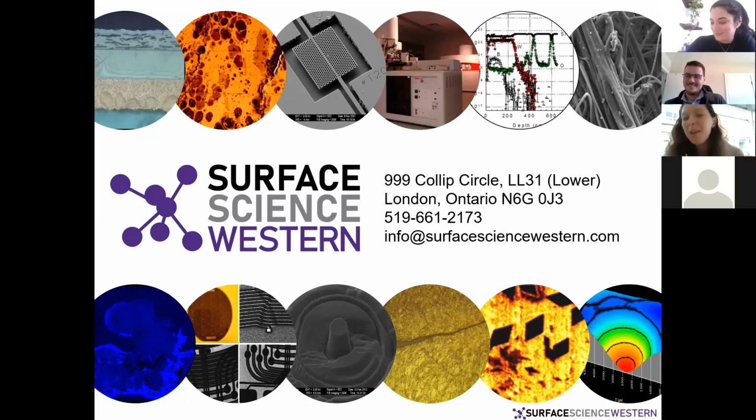Is shake-up the same word that you can use for satellites, or no? They do kind of use them interchangeably. There's some physics behind there. I've seen shake-up, shake-down, and I've seen them called satellites. I just call it structure, and I let the physicists go in and do modeling, and they'll say, well, this is the D9 to D10 transition. I'm an applied chemist. I don't get into that stuff.